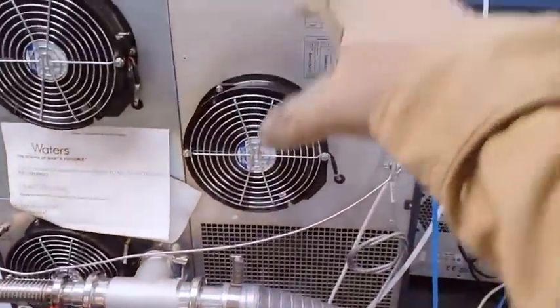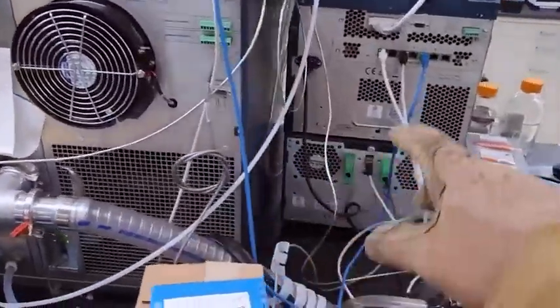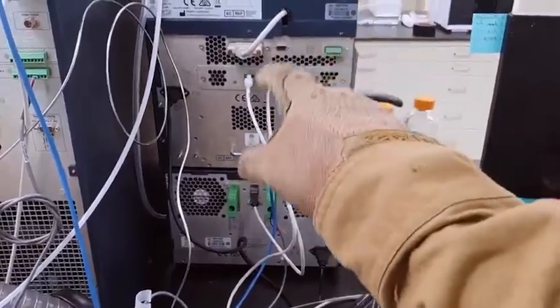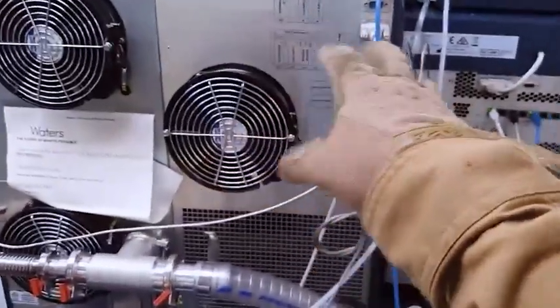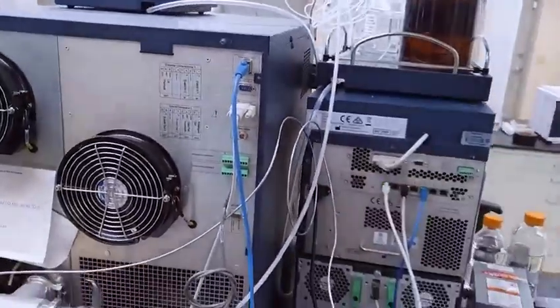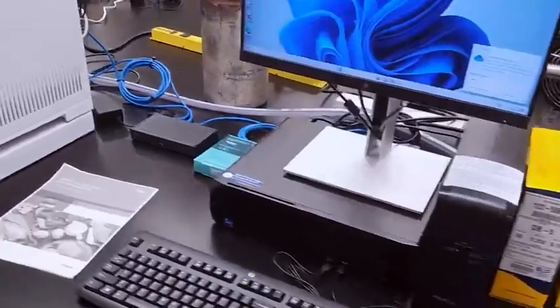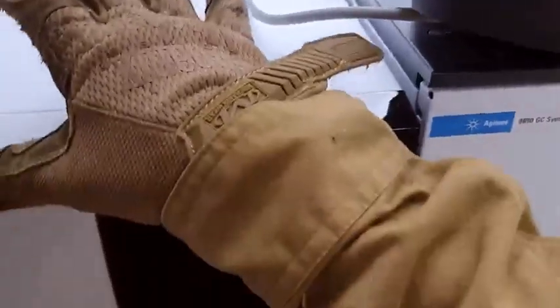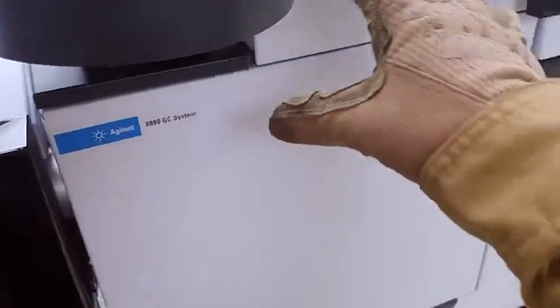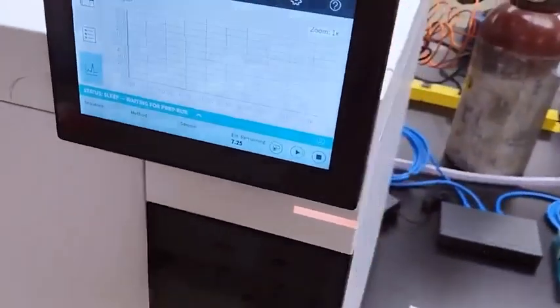By comparison, this is the back of our Waters triple quad mass spec liquid chromatography instrument — it's much larger. That's the auto sampler and the LC part of the instrument there. This is the mass spec — this is what we use for testing glyphosate, by the way. You can see some of the chemistry bottles and solvents on top. Over here on this new GC instrument it is remarkably small, which is pretty cool. It doesn't have a plasma torch like our ICP-MS, which is the heavy metals mass spec instrument. I'm going through training on this coming up in a few weeks.